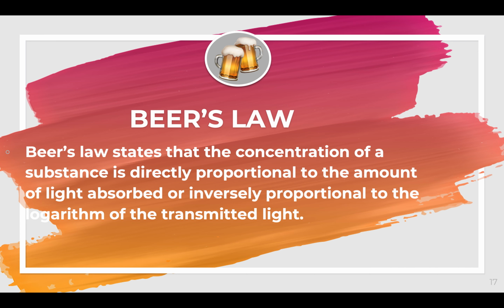Eventually, as we go through your spectrophotometer later on, we will be discussing the different components, and I hope that you will be able to tie up the importance of your visible region, your infrared region, and your ultraviolet region when we go to your different components.